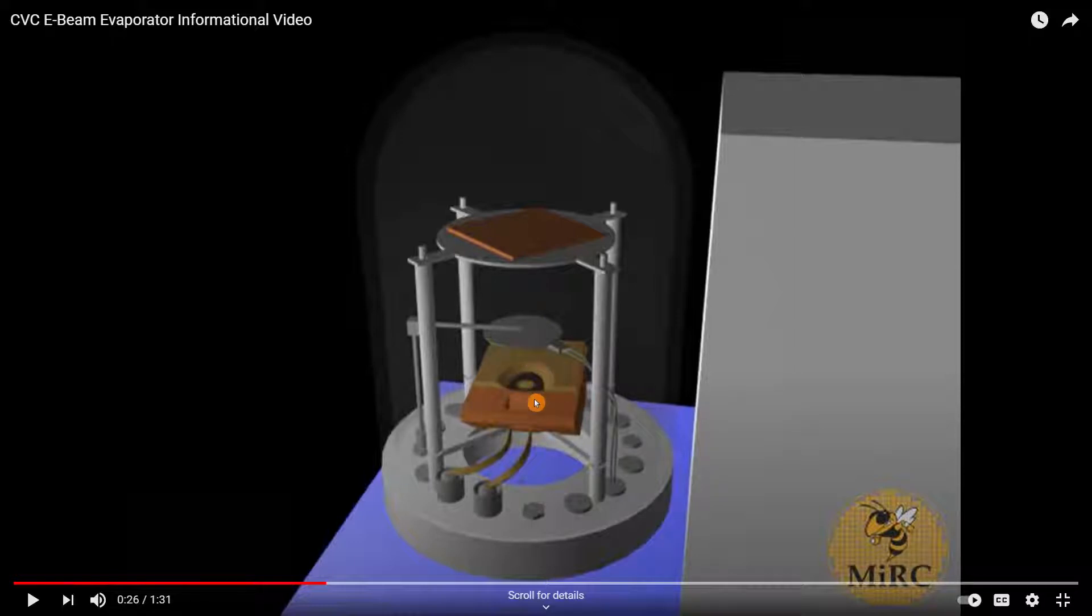You have different metals: aluminum, copper, platinum, gold, etc. And here you have the quartz crystal.